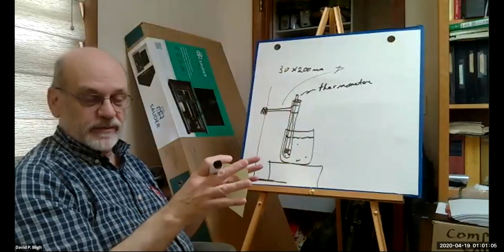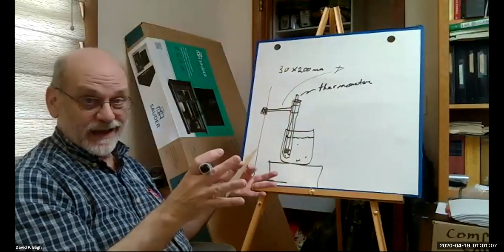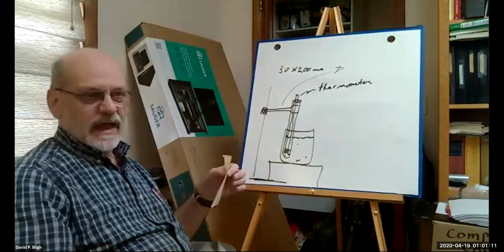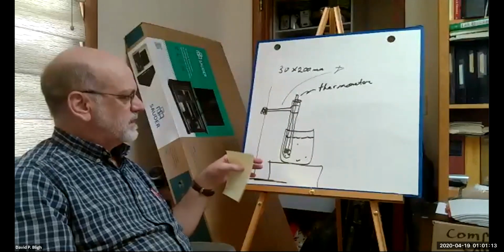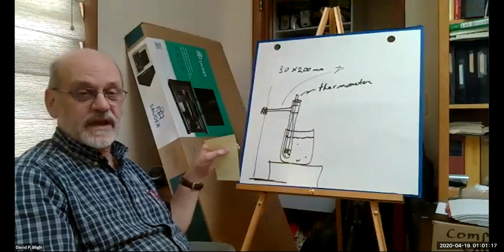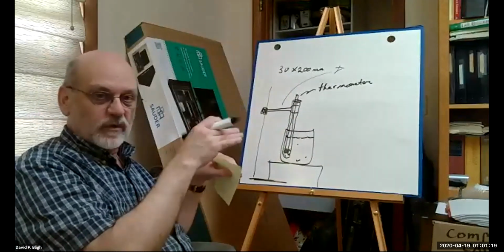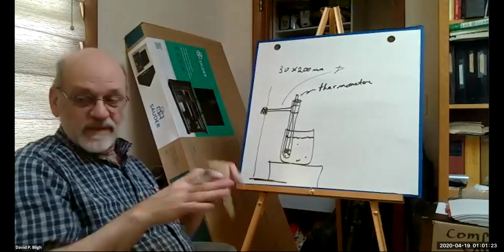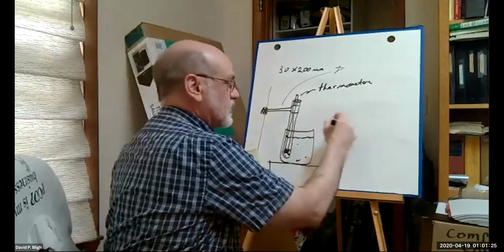And you watch the temperature. Initially it's going to be pretty high, maybe 75 or 80 degrees. Measuring temperature at that point is kind of a waste, because you want the temperature at the point when it changes from liquid to solid. Right? So the method says wait till 60 degrees.